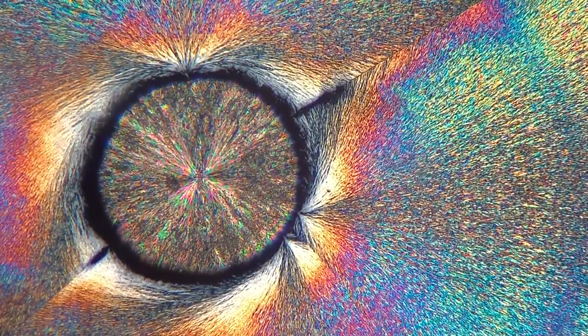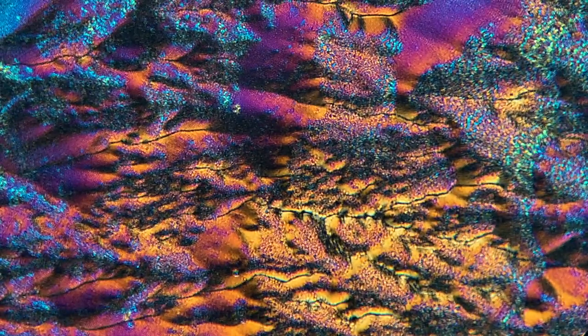Another thing to point out is that it's kind of hard to zoom on these things. I'm trying to focus right here, and I just can't find the perfect focus because some of these crystals are just so small. Here's what it looks like just from the eyepiece, so it's zoomed out a little bit. And this was another really cool image — I feel like this was something from space. And this one too, kind of like a Space Mountain type thing.